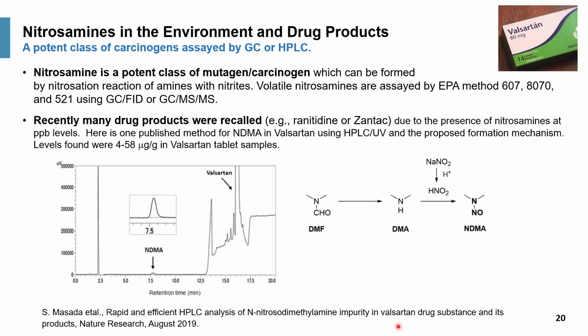I think it's Diovan being trademarked. So they can find a pretty good level, or trace level, of the dimethylamine analog of nitrosamine in these drug products. That elicited a whole wave of testing, a lot of emergency testing in a lot of pharmaceutical companies, and also quite a number of recalls.